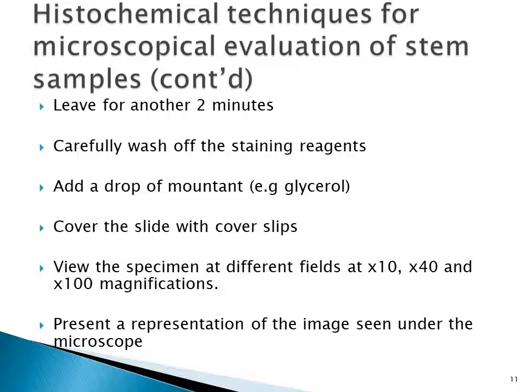Please take care that when you're washing the staining reagent from your slide, you don't wash away your samples, your specimen, because if you do, you have to start all over again. So you have to take care when you're washing up the staining reagent that you don't wash away your specimen.